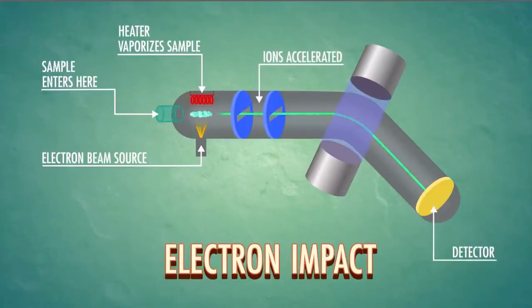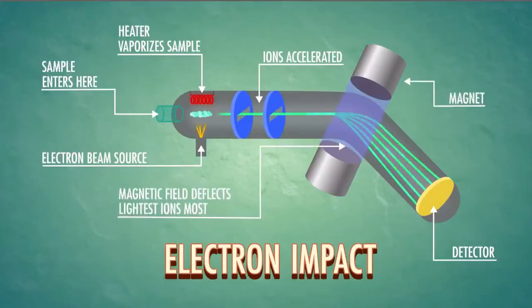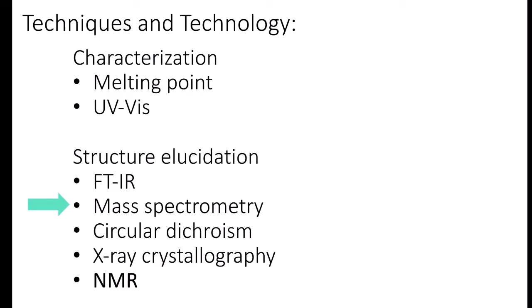However, electron impact is sort of like a bullet hitting a glass bottle, so sometimes the sample molecule is broken apart into other ion fragments. Any molecular ions and ion fragments are sent down a tube where a variable magnetic field sorts them by mass. This way, only particles of a specific mass can hit the detector at one time.